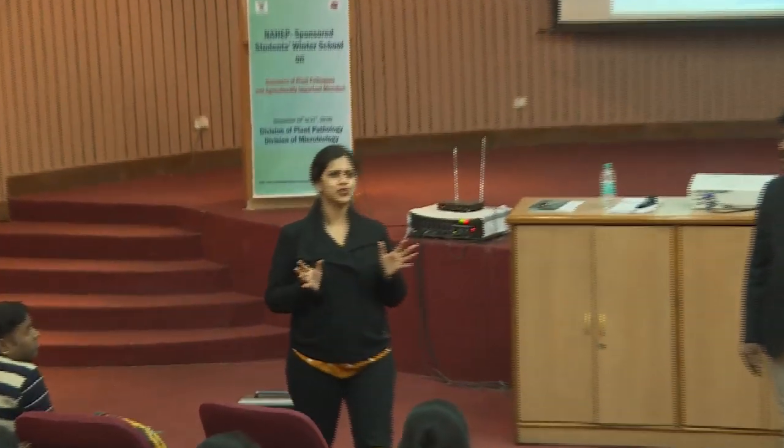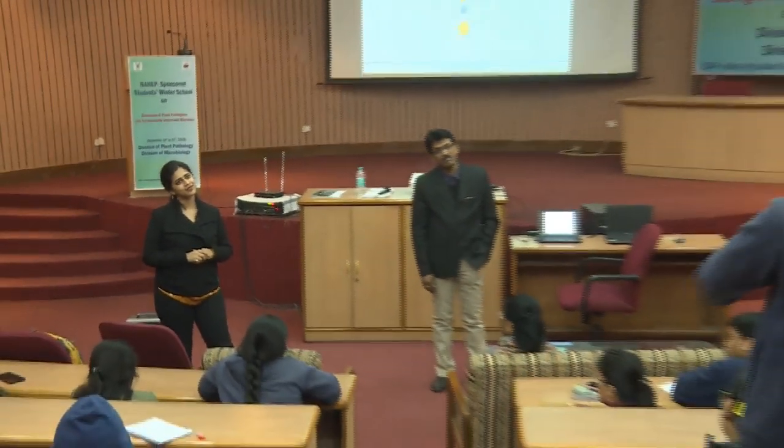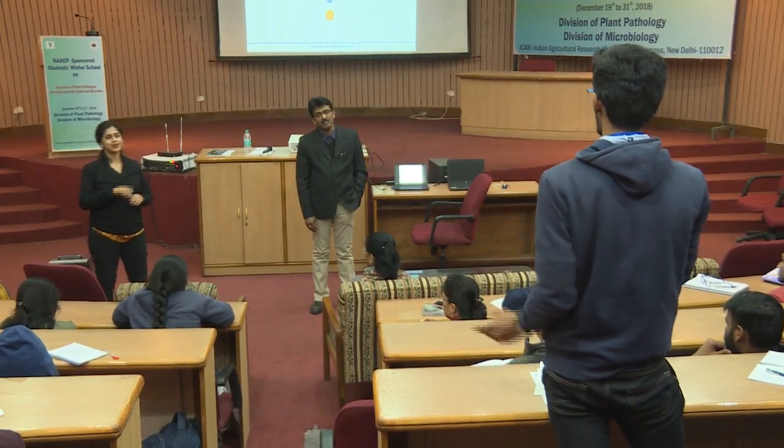No. See, we will use a hybrid approach. Whether it is a heterozygous genome or not will not matter much; the complexity of the genome will matter, right? So, in the hybrid approach, when we are assembling, those things will get eliminated. Second thing, the de Bruijn graph only cuts the genome into smaller regions, nothing else, and it forms a graph. In an assembly of a heterozygous genome, we may end up getting a bubble where there may be two paths rather than a single path.